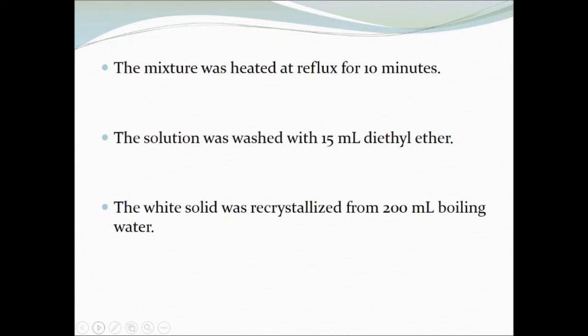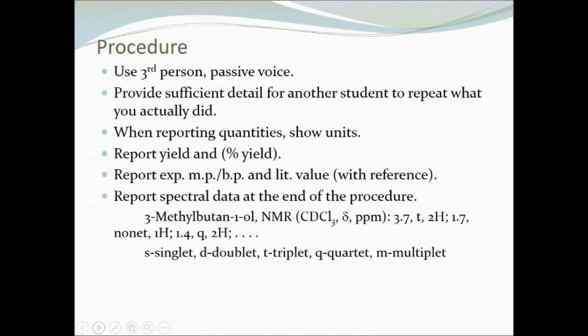And the volume. The volume will be approximate. You generally don't measure out a specific volume. You won't have something like 210.7 mils. You can just simply say 50 mils or 100 mils, 200 mils, just approximate. And it's understood that for recrystallization, we rarely measure exact volumes. You do need to report the quantities and always show units. 100 milliliters is not necessarily the same thing as 100 grams.